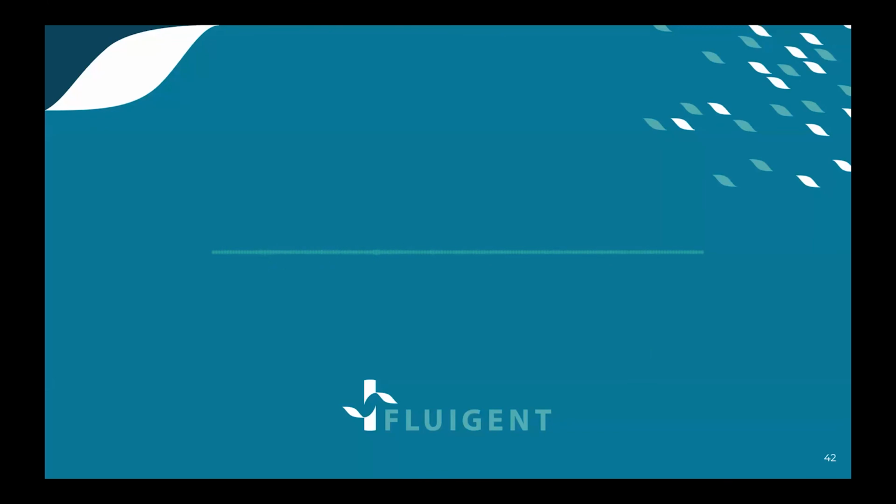Hi, good morning. First of all, it was very interesting. Thank you so much for this presentation. So I work with microfluidics and the closed loop control of cell behavior. I have two questions actually. The first one is how easy, and if it's possible at all, to interface your software with MATLAB or LabVIEW, with something that you can customize even more the delivery of drugs. And second, from one video, it was pretty clear to me that you can mix chemicals before reaching the cell culture chamber, eventually for live imaging. Is that true?